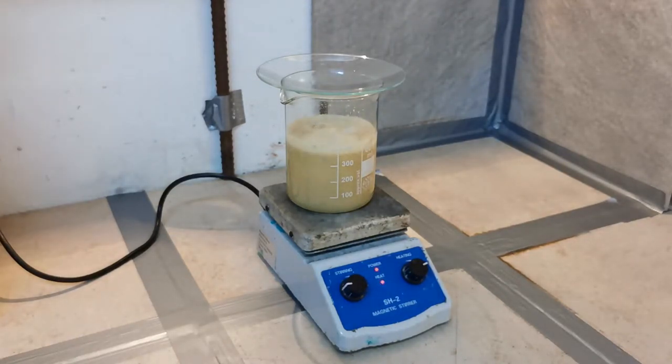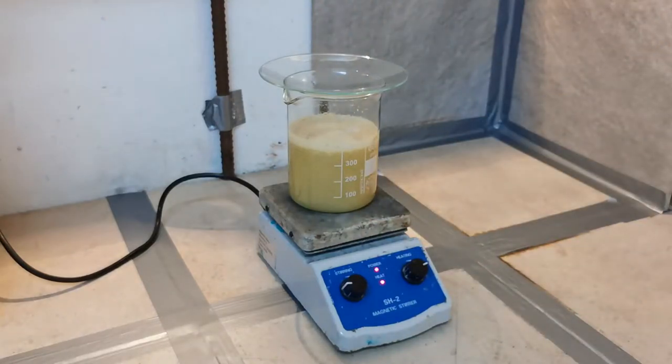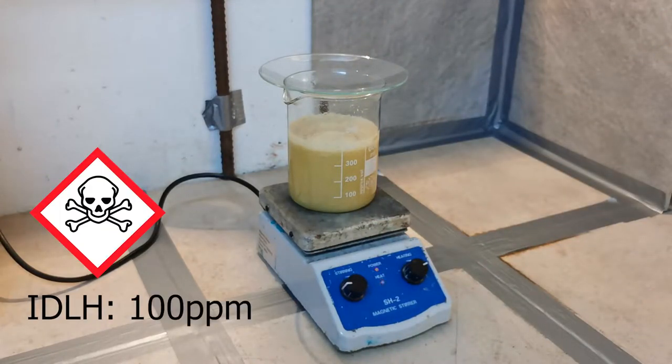Today I will show you an interesting method of producing hydrogen sulfide gas from elemental sulfur. Before I get started, I'm just going to quickly mention that hydrogen sulfide is quite toxic, so do this in a well-ventilated area, ideally a fume hood.